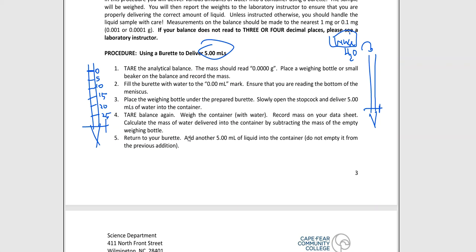All right, so I'm going to add water to the burette, and I'm not going to fill it full, but I'm going to swish it and swash it around, and then I'm going to make sure that I get all the insides cleaned as much as possible, rinsed at least, and then I'm going to dump out that water. And I do it a second time, and I do it a third time.